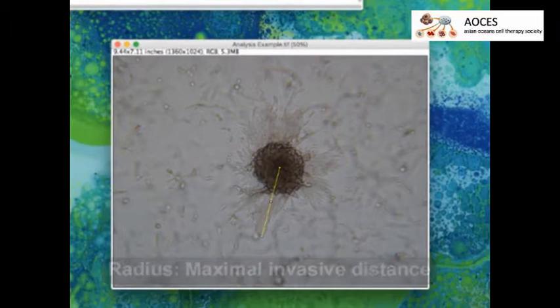To determine cell distance from the edge of the spheroid, use the Straight Draw tool to mark the radius. Then click Analyze in the top menu, followed by Measure to display the length measurement.